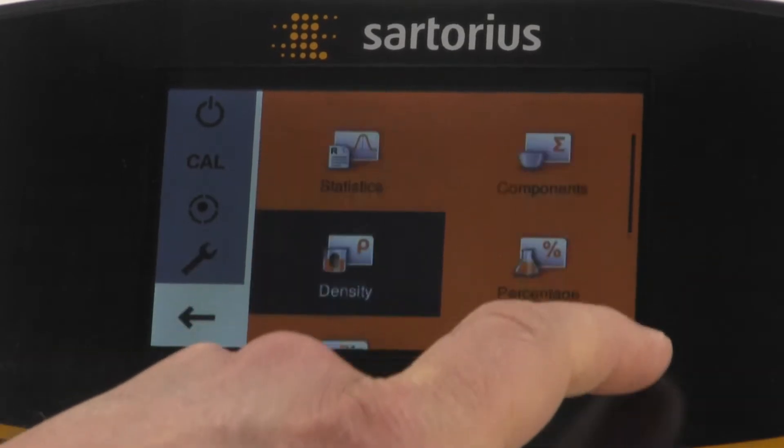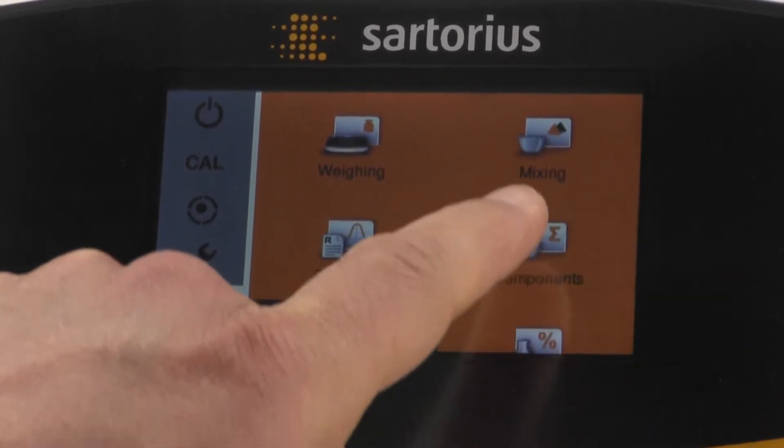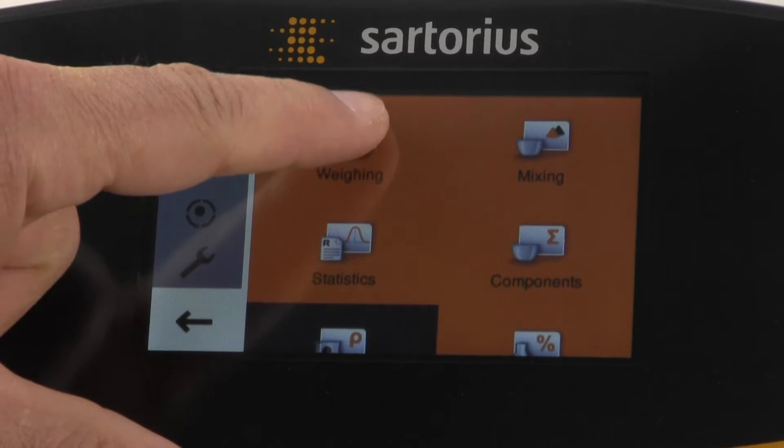The available weighing applications include density, percent weighing, statistics, components, and mixing. We're going to select Weighing.